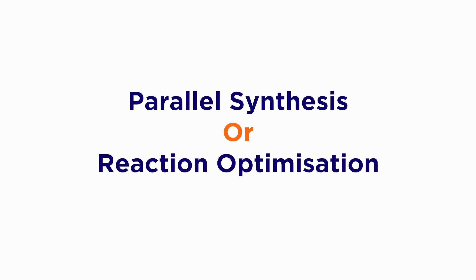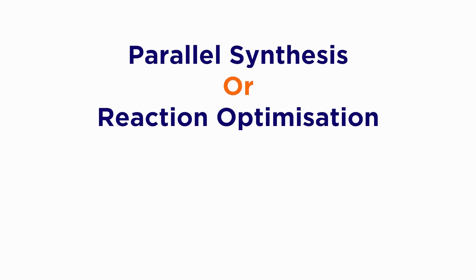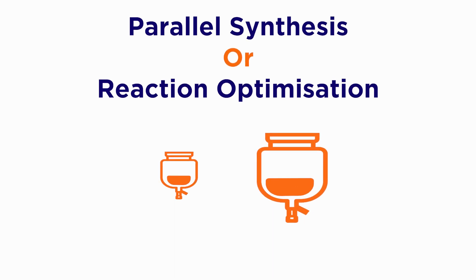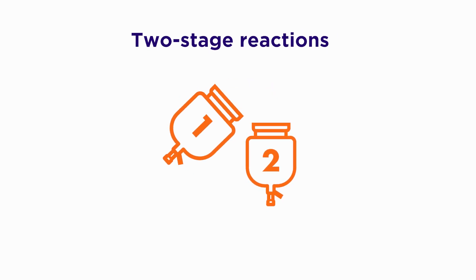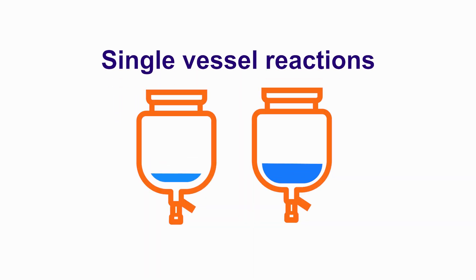Reactor Ready Duo is perfect for parallel synthesis or reaction optimization, where you can use similar or different sized vessels and various stirring speeds, stirrer shape, and temperature between vessels. It also suits two-stage reactions where you can transfer reactant from one vessel to the other using vacuum or a pump, or as a single reaction vessel where the second vessel is used as either a receiving or feed vessel where reagents can be preheated or pre-cooled prior to addition.